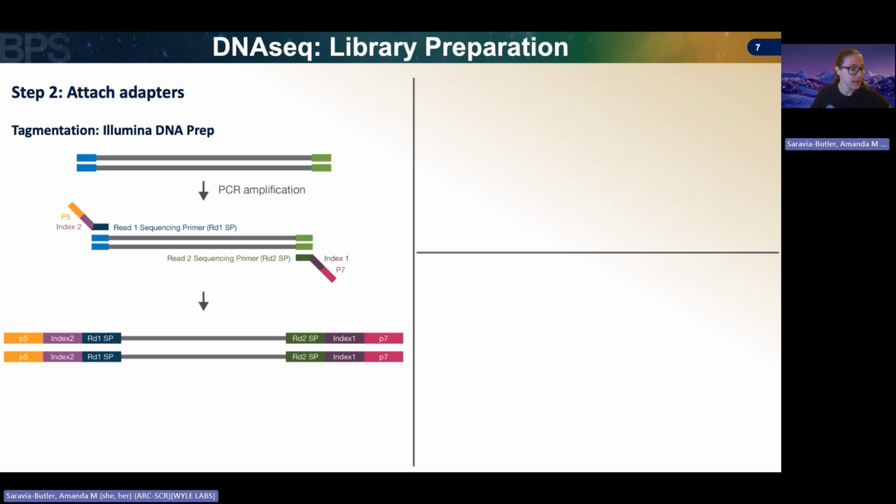So sequencing adapters have three key regions in them. One is going to be the sequencing primer, which again is just a known strand of A, T, Cs, and Gs that we're going to use to prime it for sequencing by synthesis, similar to what I showed you in the pyrosequencing overview. So the sequencing priming region is one of the three parts of the adapter.